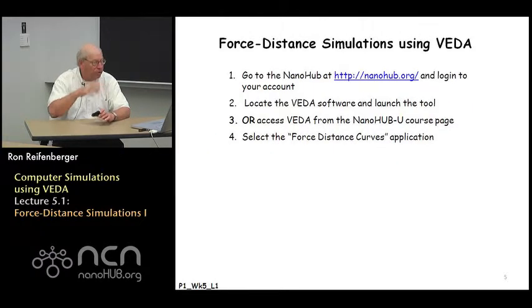For the first simulation that we're going to do today, I'd like to walk through a force distance simulation using VEDA. There's a variety of ways to access the VEDA software. One is to go to the nanoHUB. The other is to go to the course page on nanoHUB-U. Both those routes should allow you to readily access VEDA.